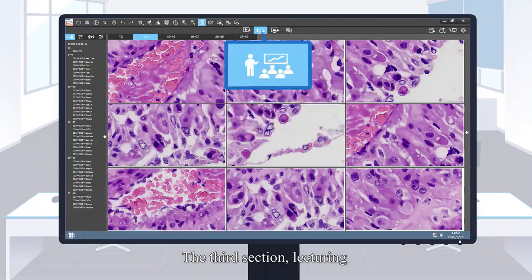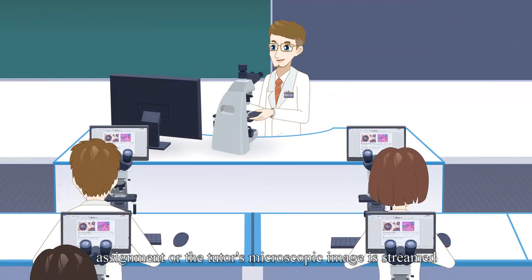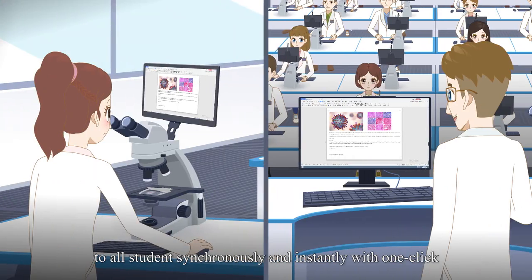The third section, lecturing. Digital teaching materials, assignments, or the tutor's microscopic image is streamed to all students synchronously and instantly with one click.